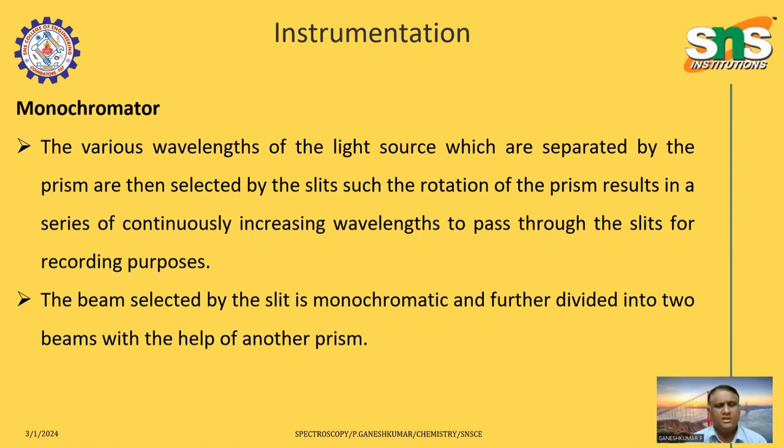The various wavelengths of the light source, which are separated by the prism, are then selected by the slits. The rotation of the prism results in a series of continuously increasing wavelengths passing through the slits for the recording purpose.